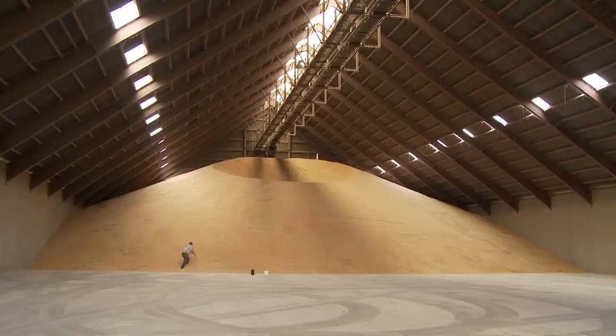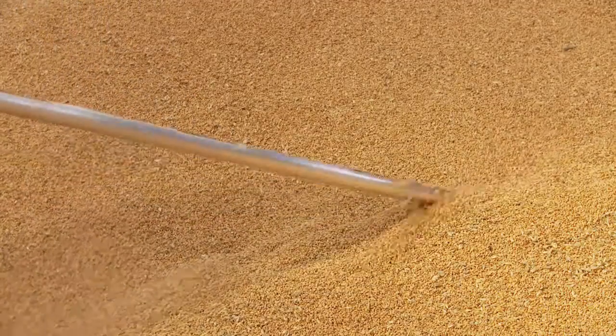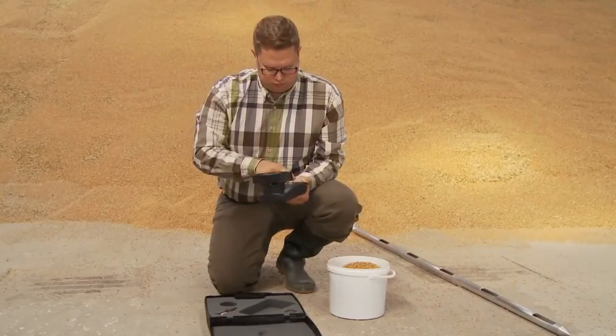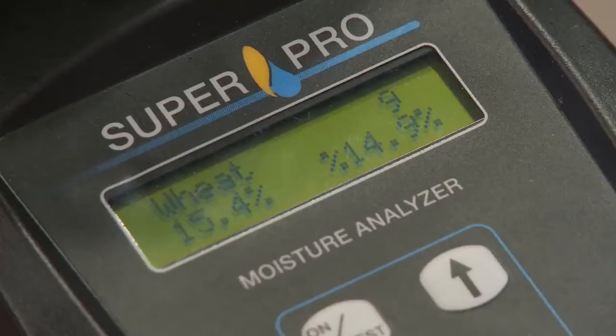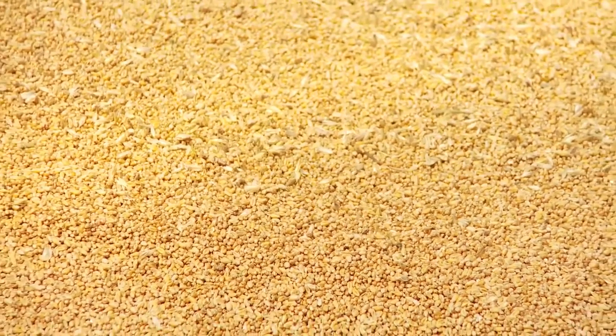Once the crops need to be stored, it is important to have the right moisture control to ensure the quality and avoid loss. The SuperPro Moisture Analyzer is perfect to give you exact measurements, so you can avoid high moisture and diseases to get the best price for your crops.